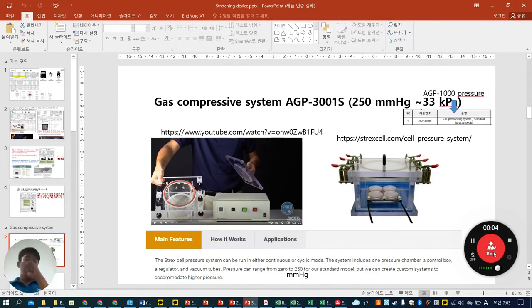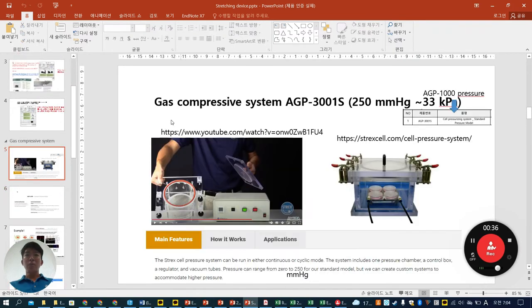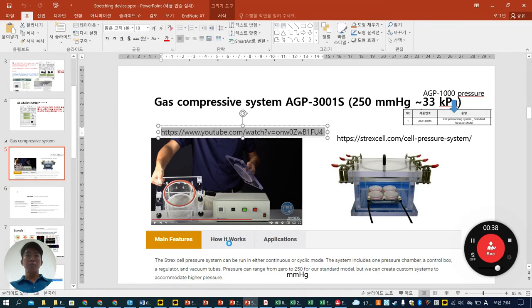Okay. Today I'm talking about the device we recently bought. The first device is a gas compressive system. The catalog number is AGP3001S. It can generate 250 millimeters of mercury pressure, around 33 kilopascal. So that is the feature, and then I will show you how it works using a YouTube video.